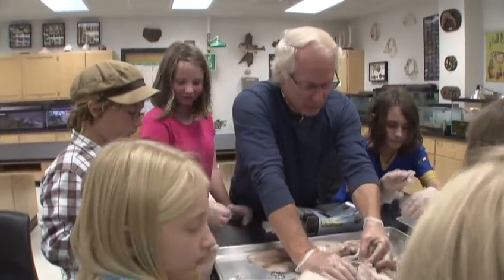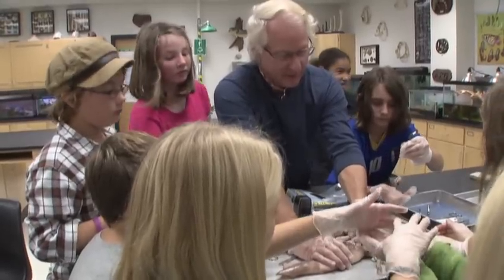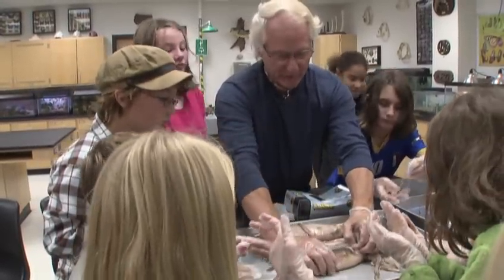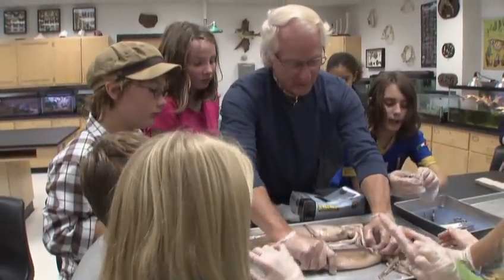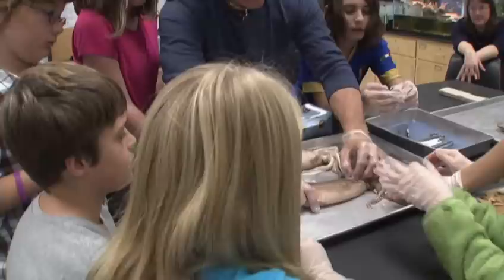Okay. I'm going to grab Courtney's here, and I hope I can pull this out. But look, see this thing sticking out right here, you guys? I didn't take mine apart. Everyone see it? I'm going to pull this out now. I hope I don't break it. This is the pen. Ooh, that's a good one.